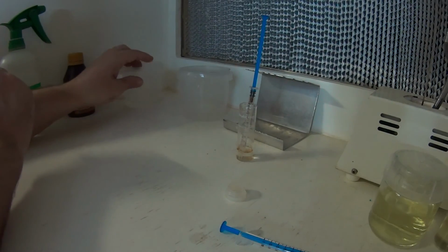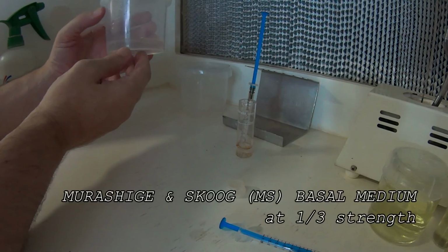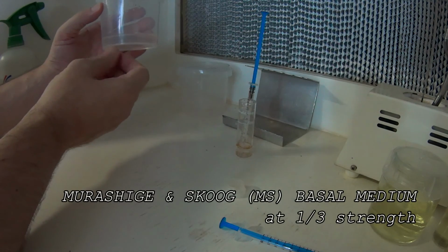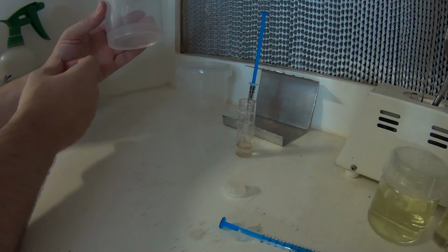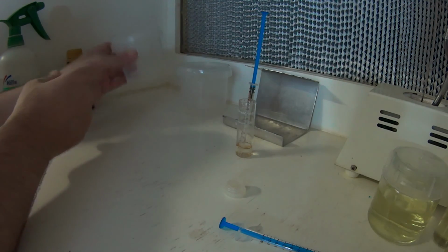Oh, and before I go, the media I'm using is just MS media at about a third strength or half. I usually go third for carnivorous plants and orchids, and it seems to work well, but you can use up to half, but I prefer using a third strength. So yeah, it's pretty much the same as I use for most carnivorous plants or native plants that are sensitive to phosphates and that sort of thing.